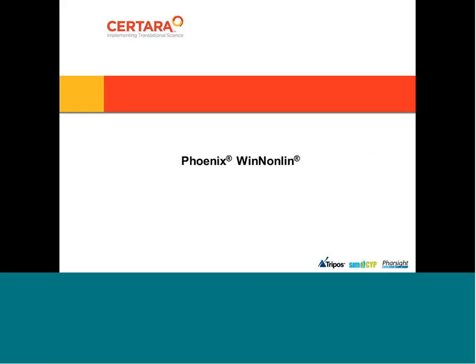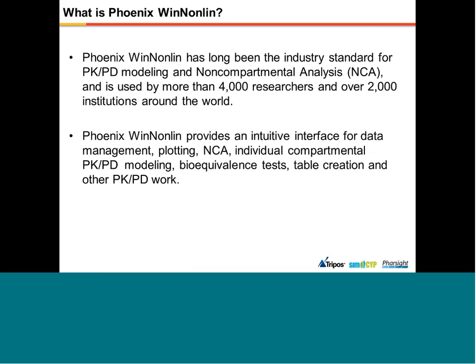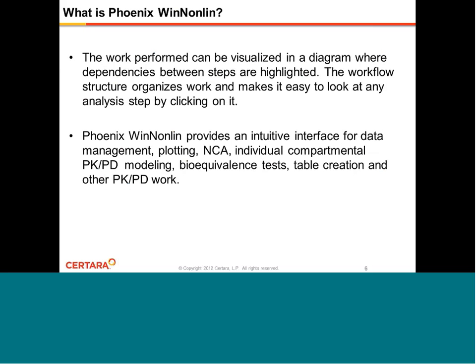So a bit about Phoenix WinNonlin. Phoenix WinNonlin has long been the industry standard for PK/PD modeling and non-compartmental analysis, also known as NCA, and is used by more than 4,000 researchers and over 2,000 institutions around the world. Phoenix WinNonlin provides an intuitive interface for data management, plotting, NCA, individual compartmental PK modeling, bioequivalence tests, table creation, and other PK/PD work.